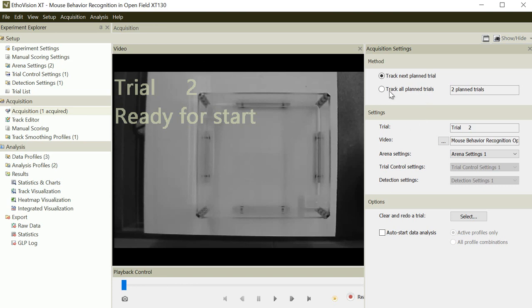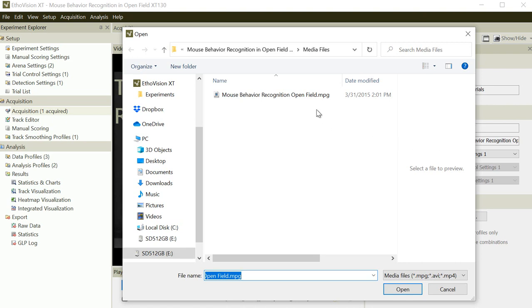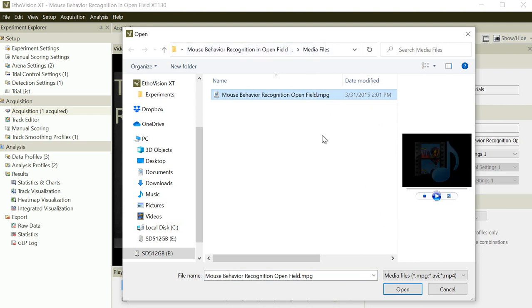And the screen should be like this. And you can select the video. So if you do not have this screen, you can select your video file, and the video file must be automatically made in your location. So it will automatically find and open this video file. This video file is included in the sample file.